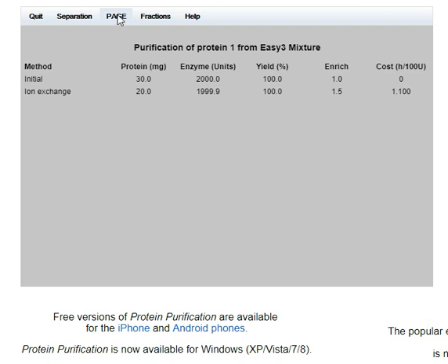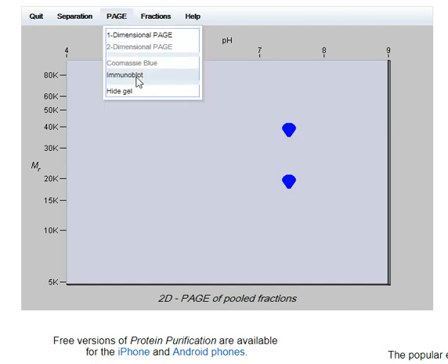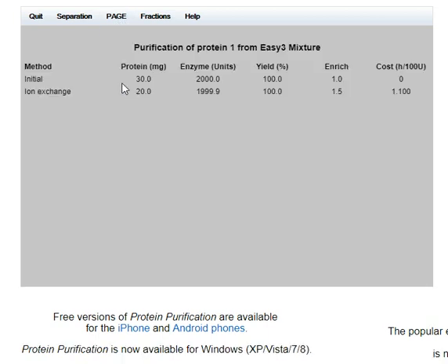Looking at what we have — that's separated them. I think we need to go for gel filtration next.